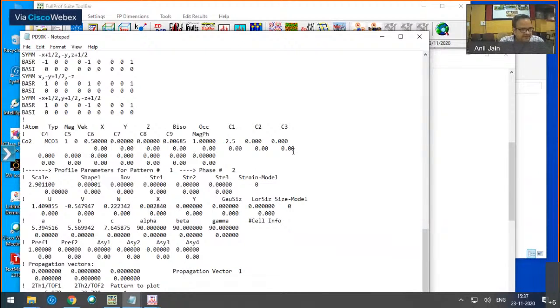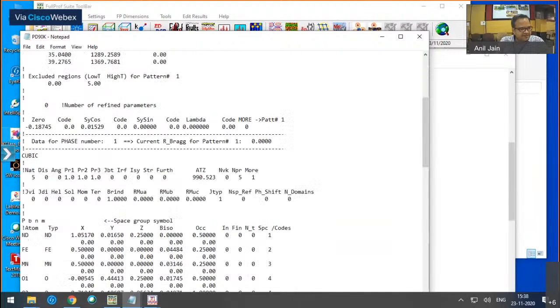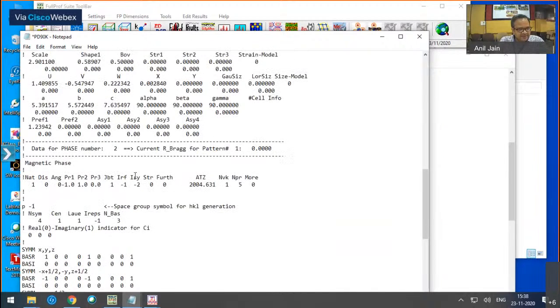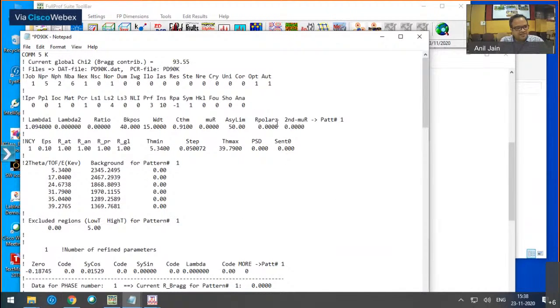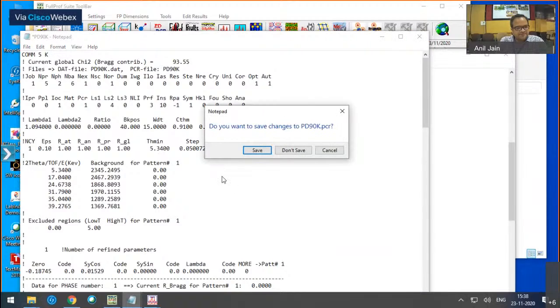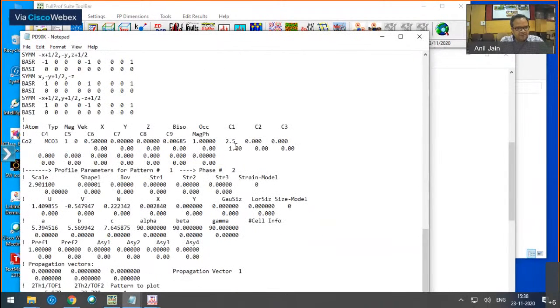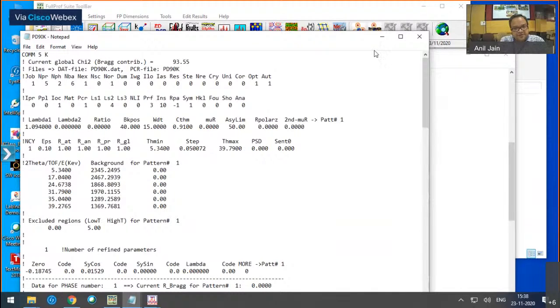Then what I do in that case is, this lattice constant, as you know, was refined at room temperature. Then I will quickly do the refinement for this file and see whether there is some hope to get this magnetic structure corresponding to this representation. So I have entered the refinement mode now by putting this code 1 here. 1 means it will try to refine this parameter C1, because I am working in this automation mode.